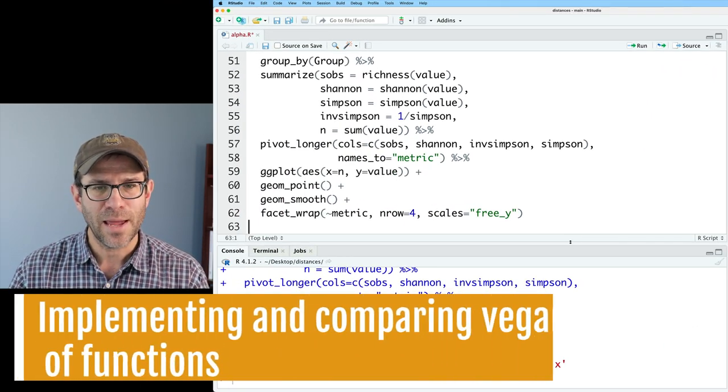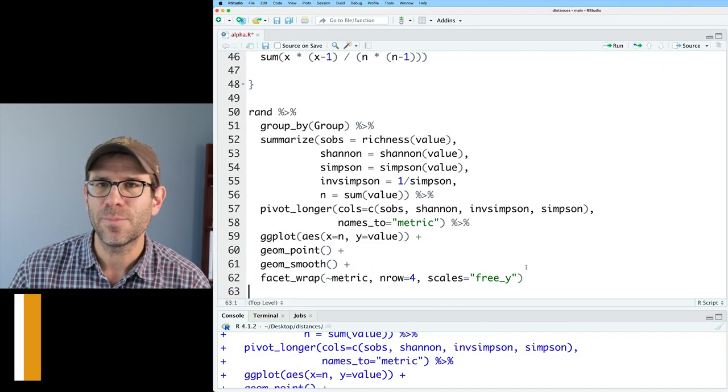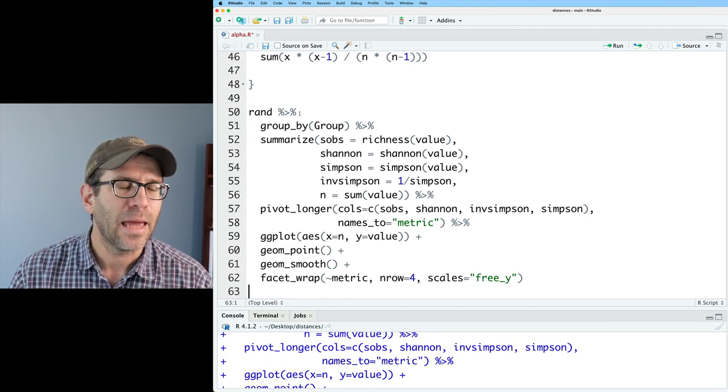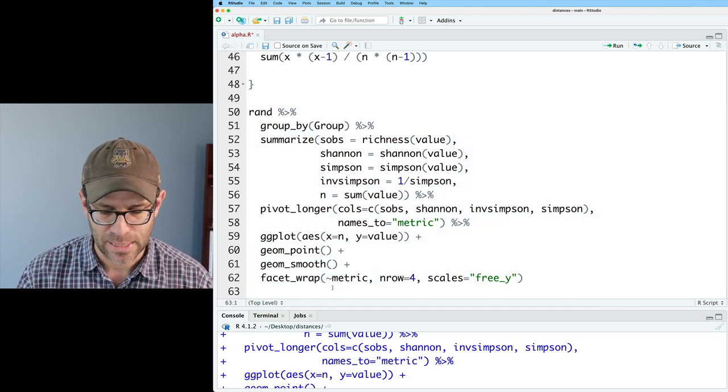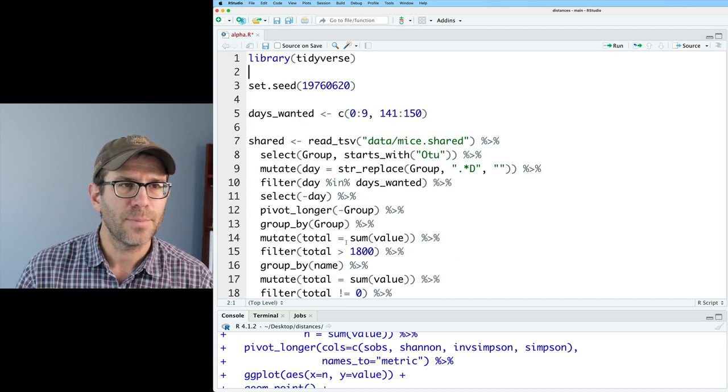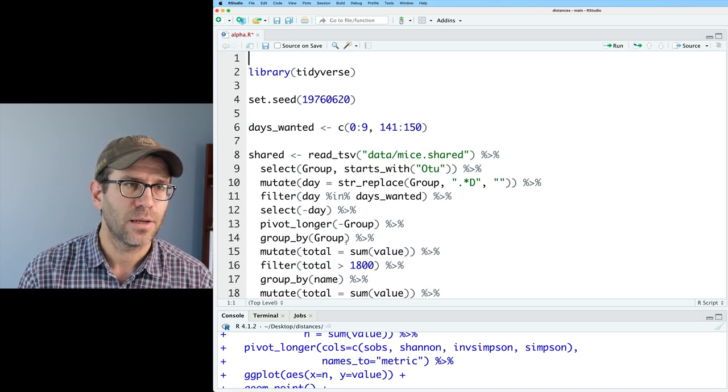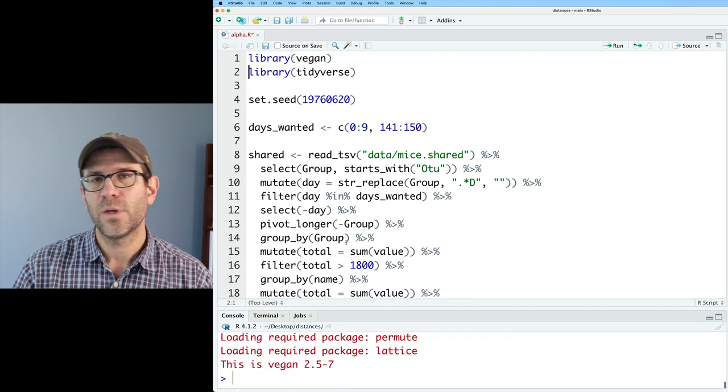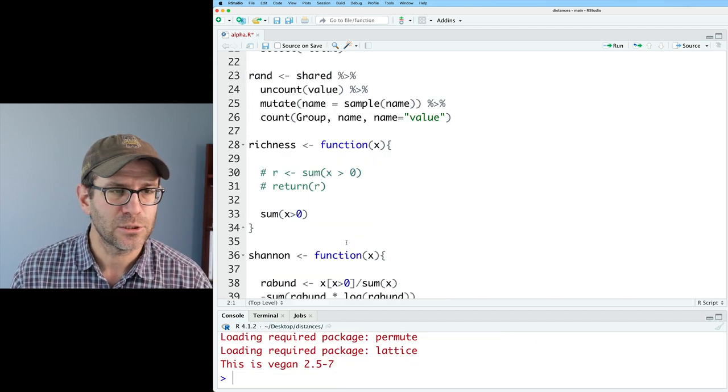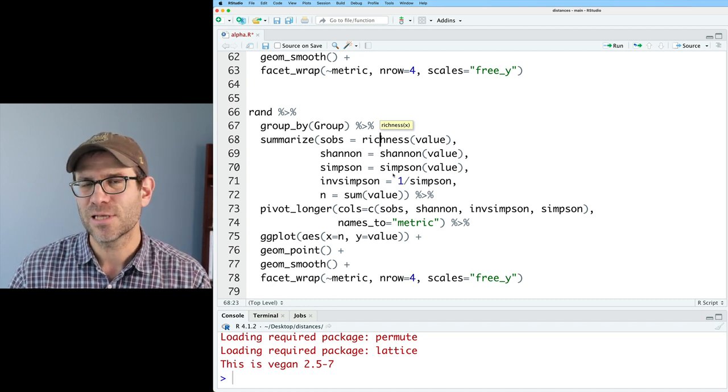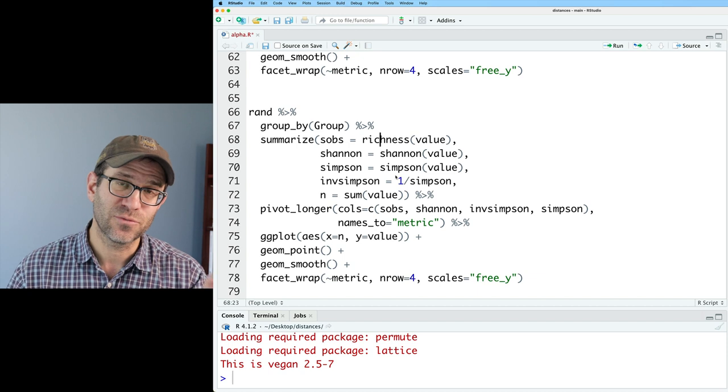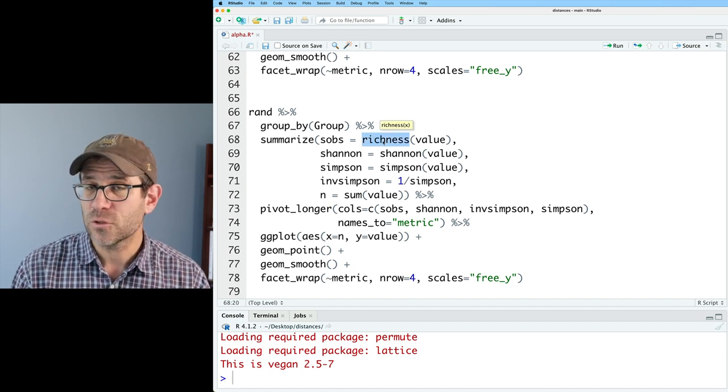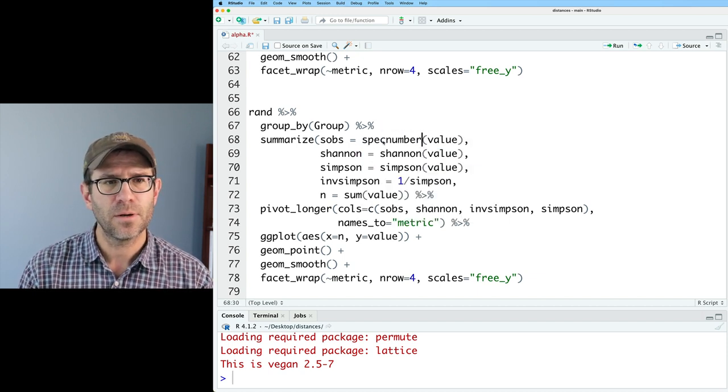One thing I want to come back though is show you how we could do the same type of thing using vegan. And so what I will do is I'm going to go ahead and copy this down and we will come back up to the top and I'll do a library vegan so that we can then load those helpful functions from the vegan R package. So I'm going to step through each of these functions and then see how we can change them to use functions from the vegan package.